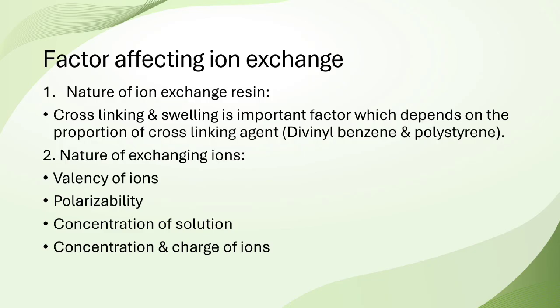Factors affecting ion exchange. First is the nature of the ion exchange resins, that is cross-linking, and the swelling is an important factor which depends on the proportion of the cross-linking agents. For example, polystyrene and divinyl benzene. Second is the nature of exchanging ions, that is valency of ions, concentration of solutions, concentration and charge of ions.